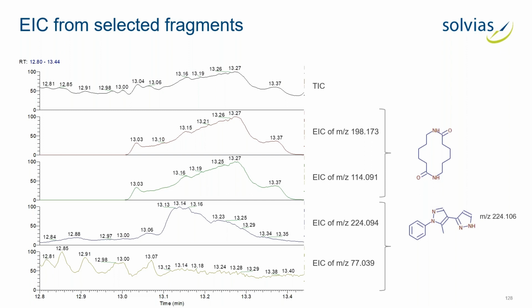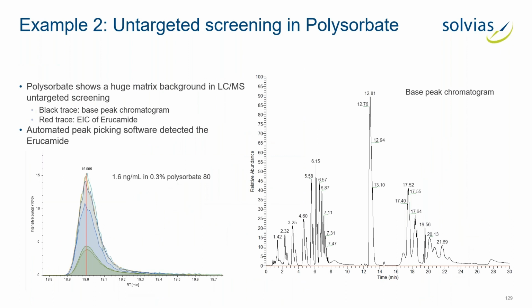This fourth one in the line belongs, for example, to another compound than the other 2 on top. And the last one seems completely different. So we had, for example, our 2 candidates and were seeing, okay, one of the signals that we were thinking belongs to the second candidate actually doesn't belong to that candidate. And it turned out, after we did the automatic deconvolution, that it belongs to another candidate. But this shows that we can do it manually, but the automated workflow is first faster, and second, it's much more accurate.